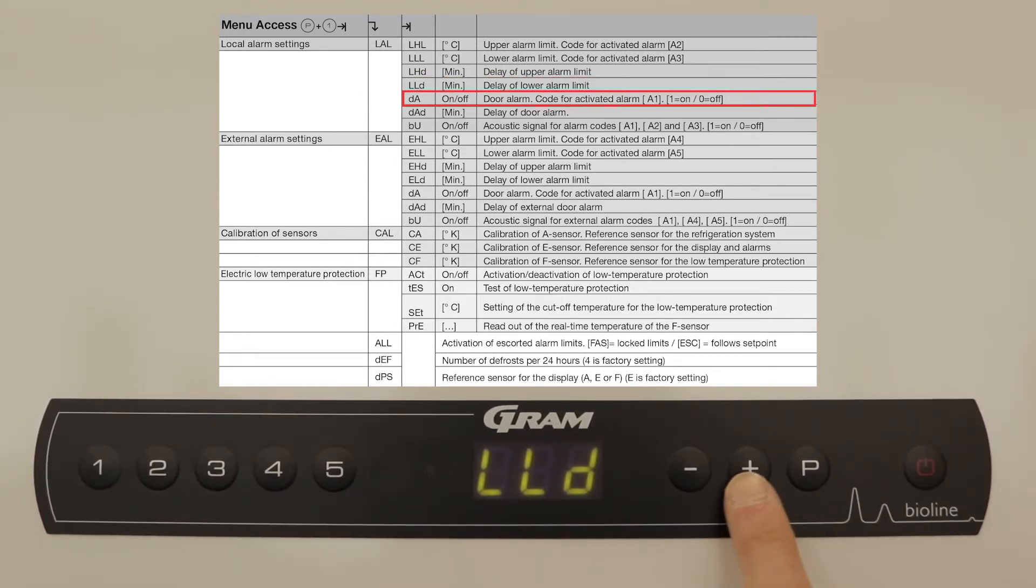We will now move to door alarm. This provides you with 2 options, 0 and 1. 0 being off, 1 being on. We will set this to 1.